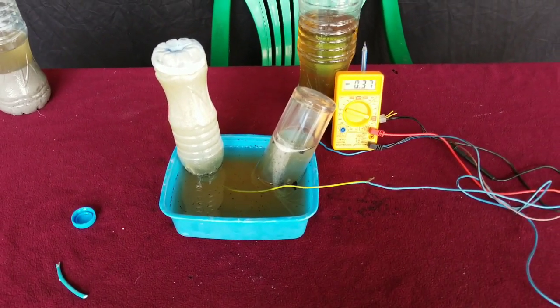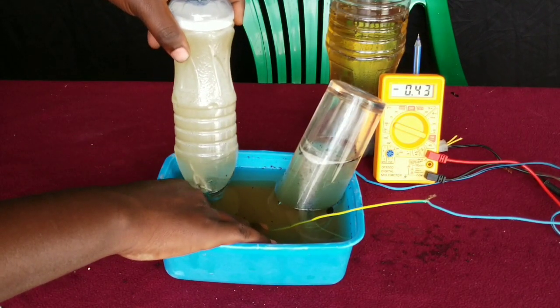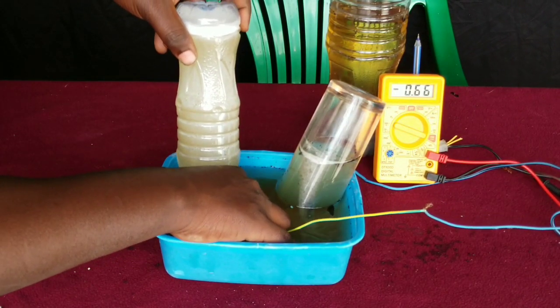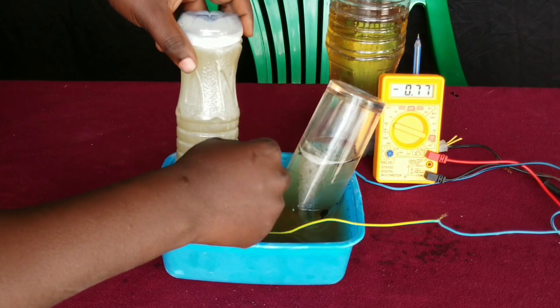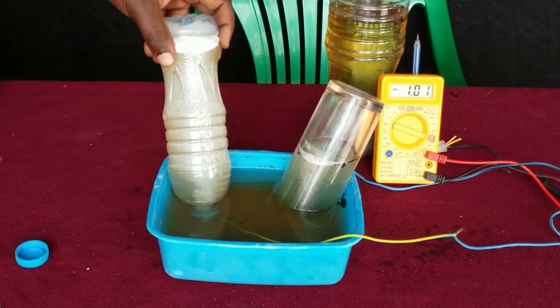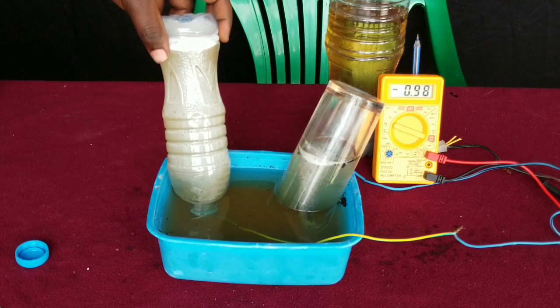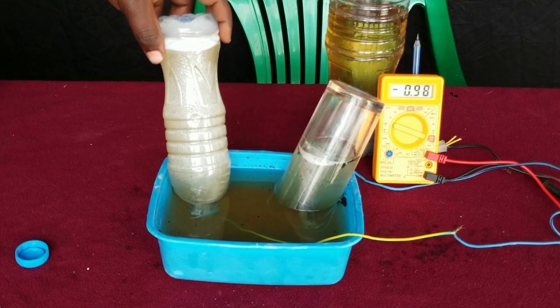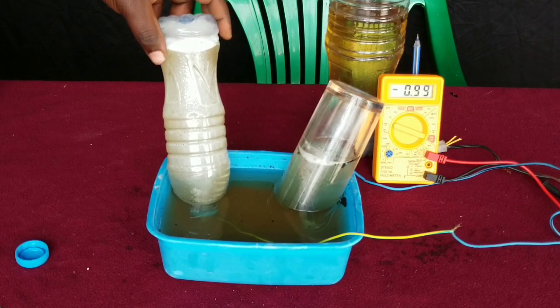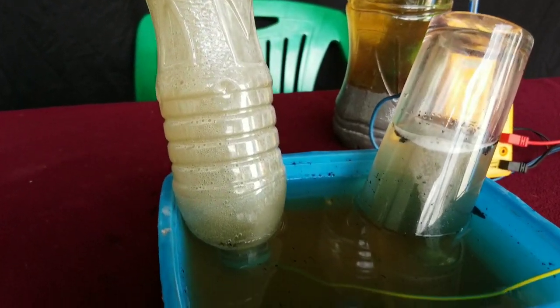You may wonder why I didn't use a salty solution to perform this experiment. First of all, a salt solution produces chlorine gas at the positive electrode, and also a salt solution is not ideal for performing other experiments.